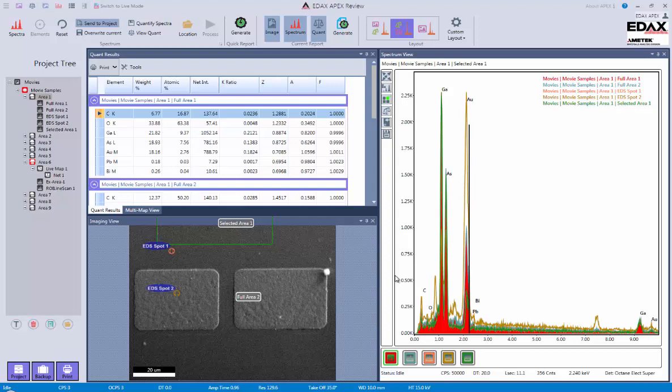This APEX video is going to cover the basics of reporting and the reporting functions. Reporting is basically just a way of pulling your data out in some other format to store for whatever your purpose is.